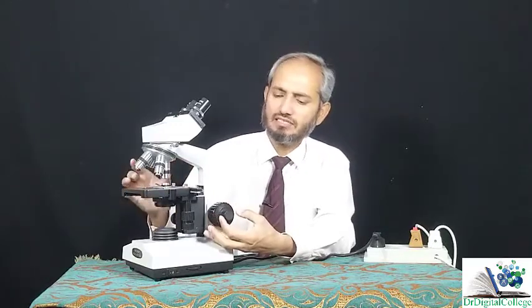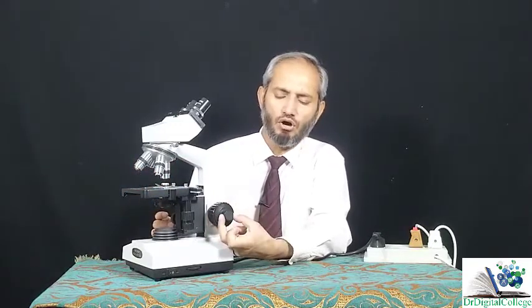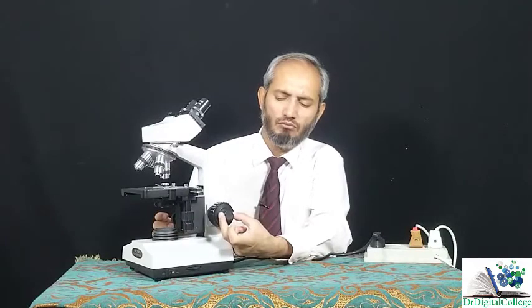But this stage can also be moved by this smaller knob. This is the smaller knob. I am moving it.